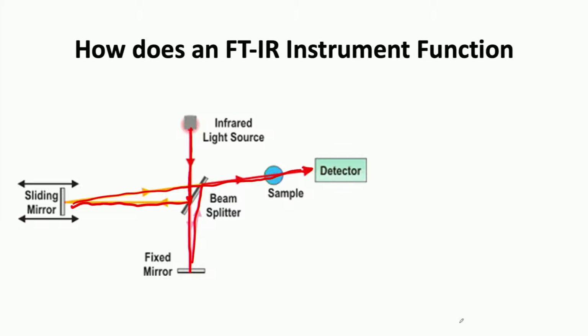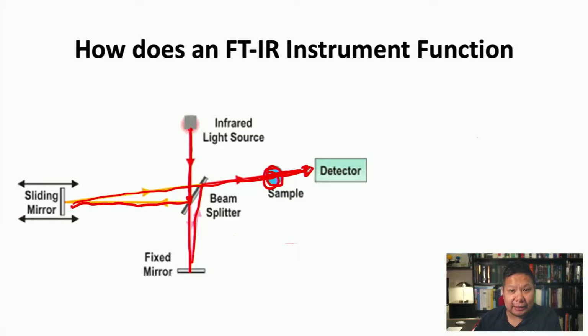So here the sample is sitting right there, the IR light comes through, and the detector detects the IR frequencies, or the IR stretches that are present as the light comes through the sample. Okay, and that's how you see an IR spectrum. Back in the day, I mean, this was really back in the day, we used to use these little salt plates, these little salt discs. They look like little discs, like that.